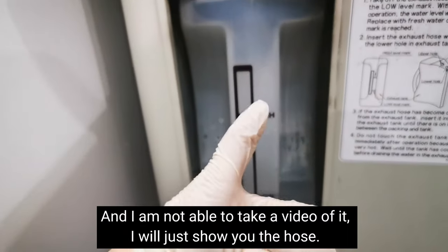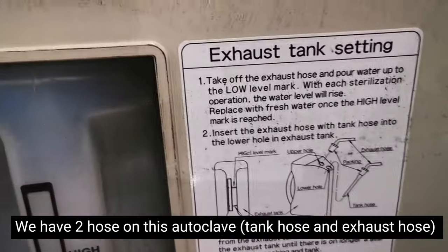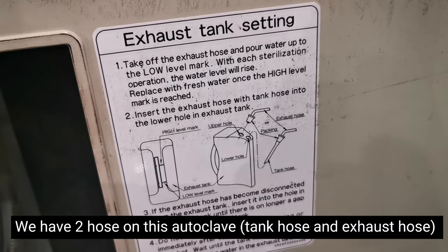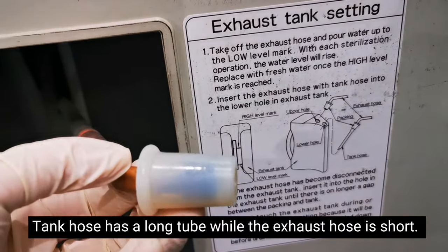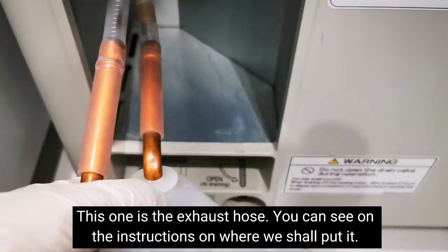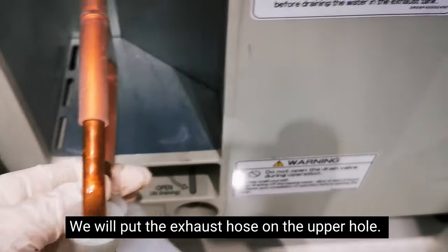So we have two hoses on this autoclave. We have the exhaust hose and the tank hose. The tank hose is the longer one. The exhaust hose is the shorter one — that's what I'm showing now — and it's labeled where to place it: in the upper hole.